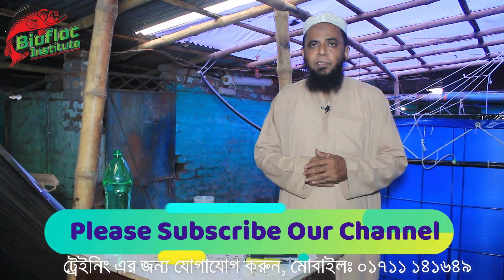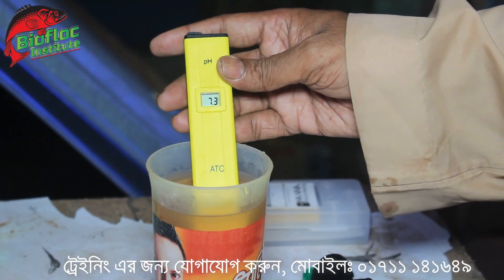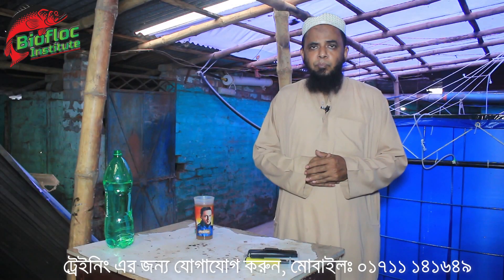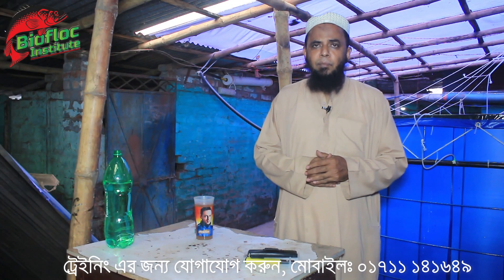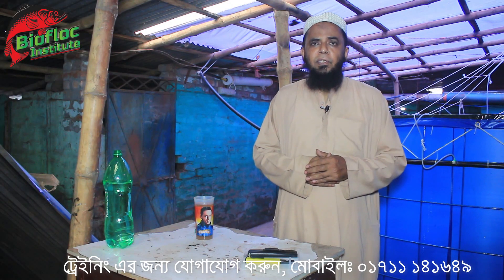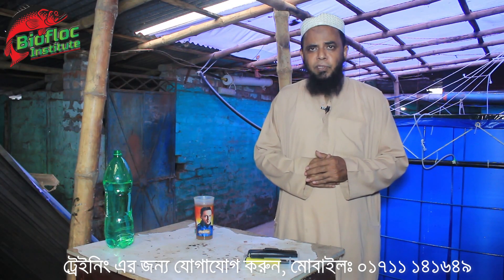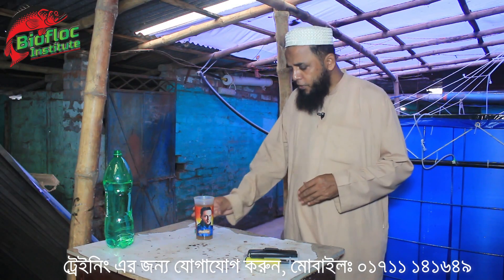We are now looking at what pH is going to be used in the process. The pH meter is going to be used. We have to test the pH meter.